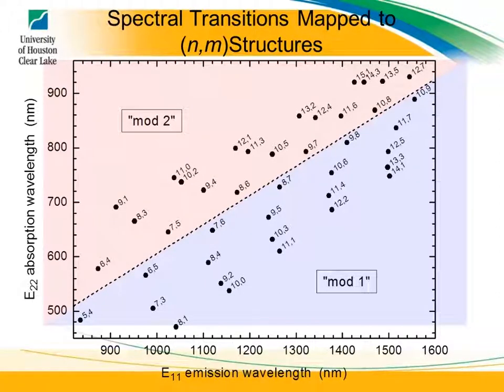So it'll red shift. What's really interesting is when you apply strain and you have different types of nanotubes in there, some will blue shift, some will red shift. And the response to strain is linear, it turns out.